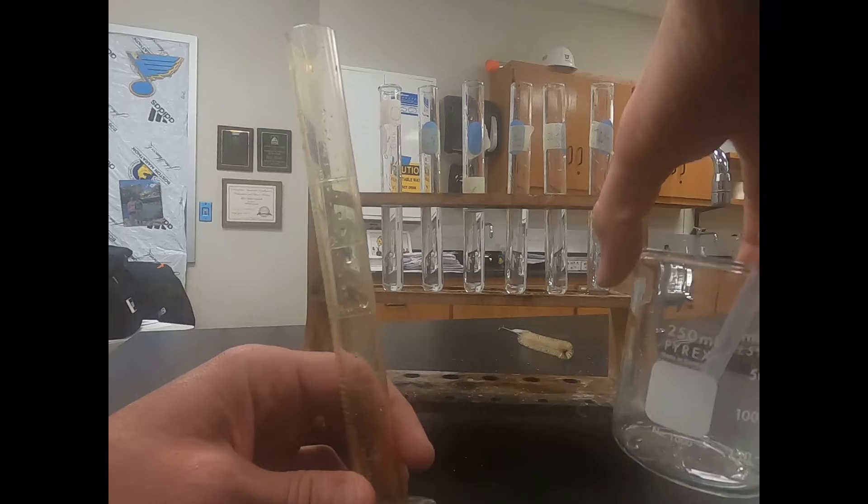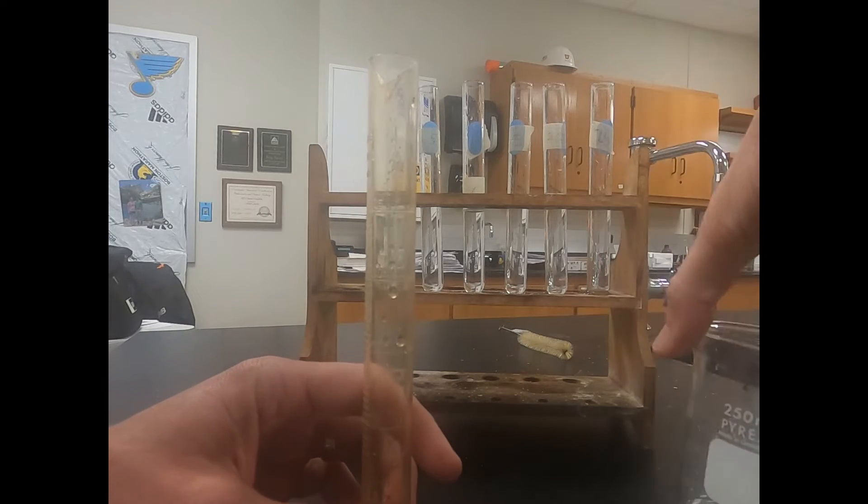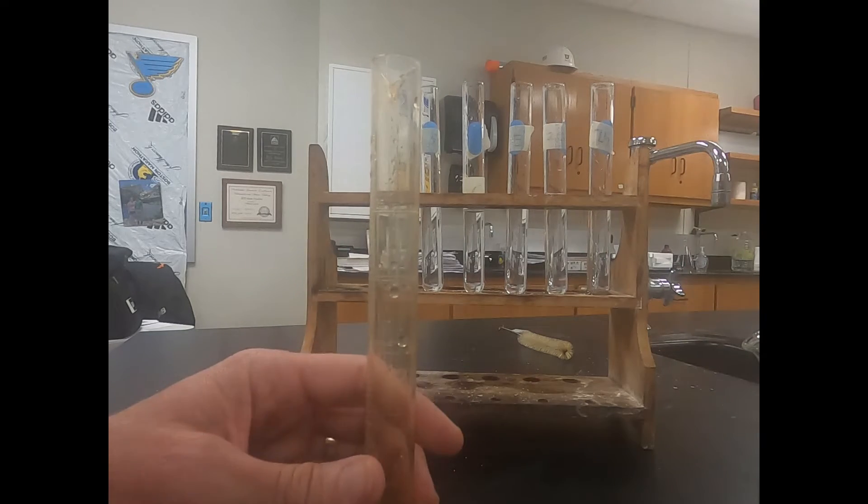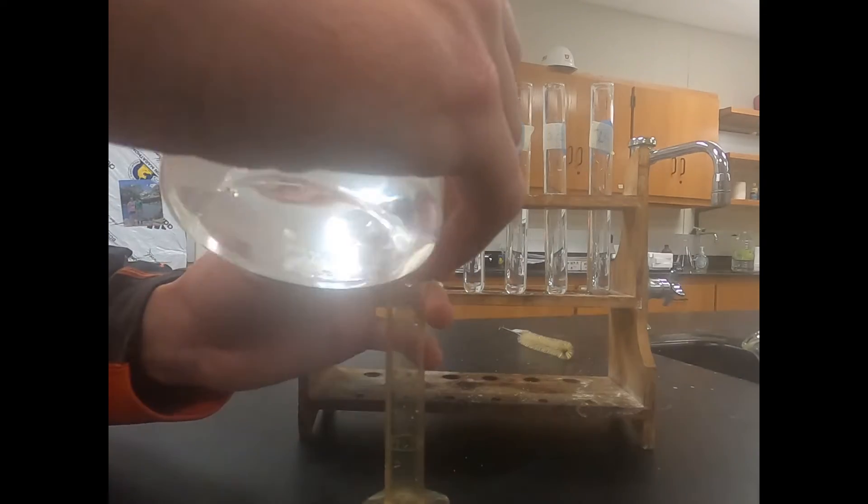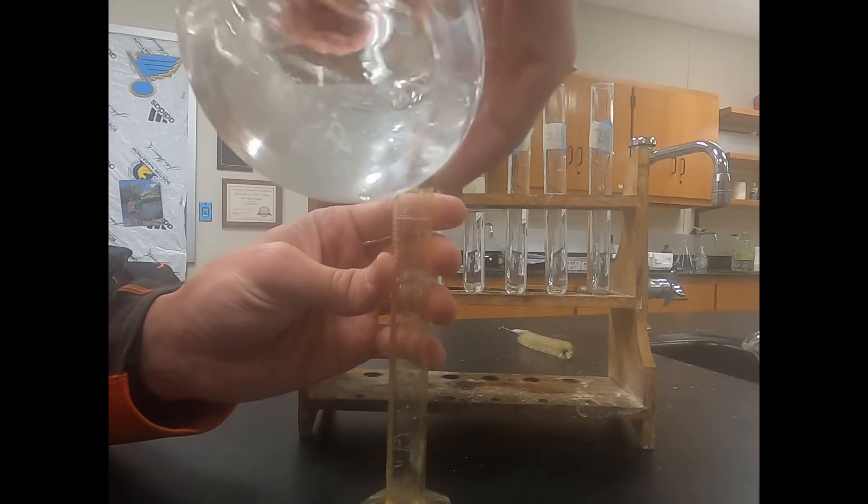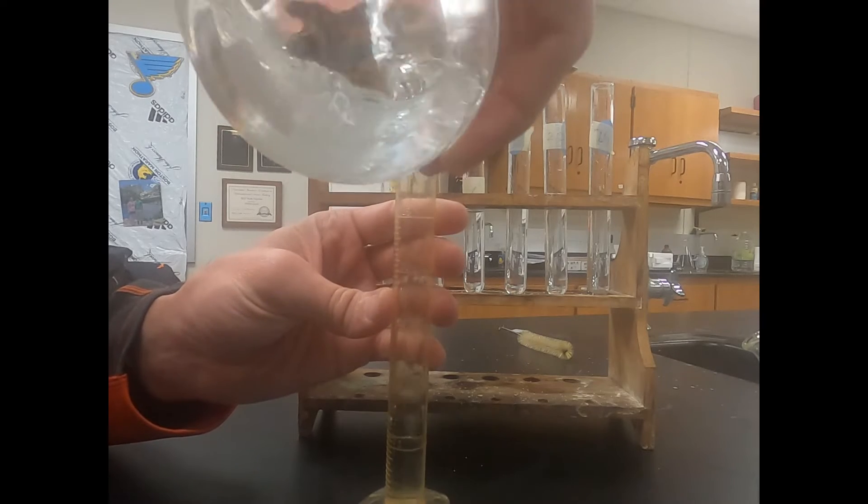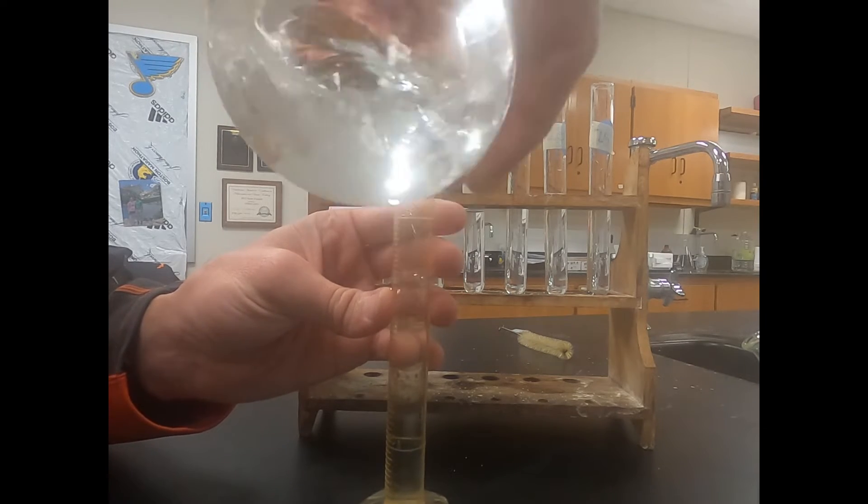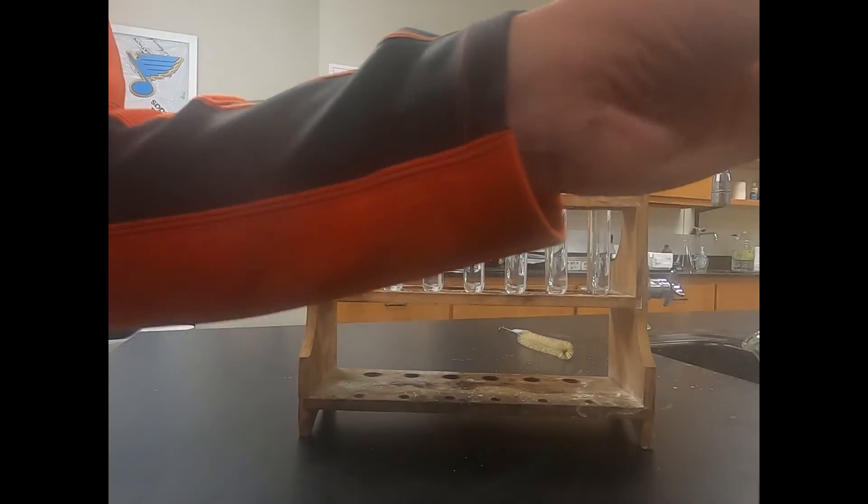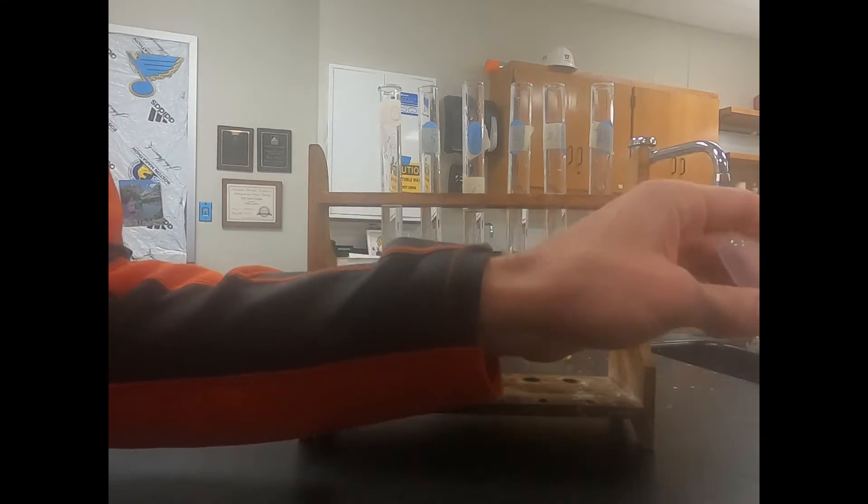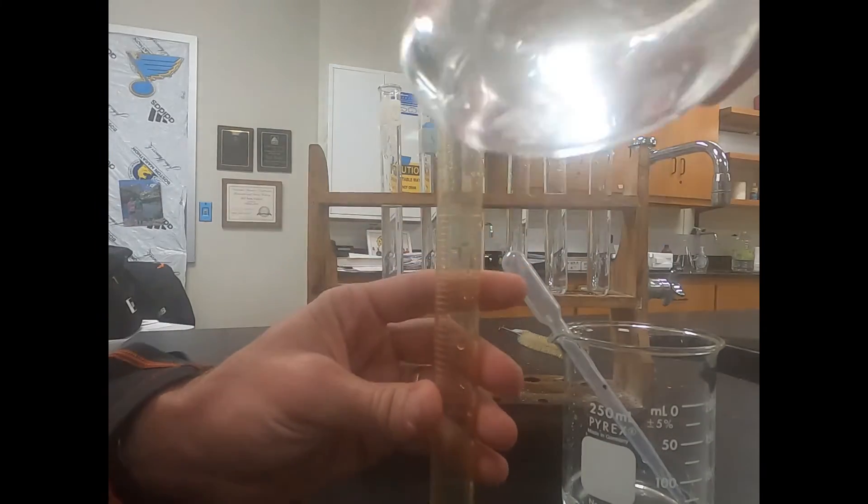So now we have 10 milliliters of water in each one of our test tubes. Next we're going to make a sugar solution we're going to use later. I have an empty beaker and I'm going to put 50 milliliters of distilled water in there. This graduated cylinder measures to 25 so I'm just going to fill up twice.